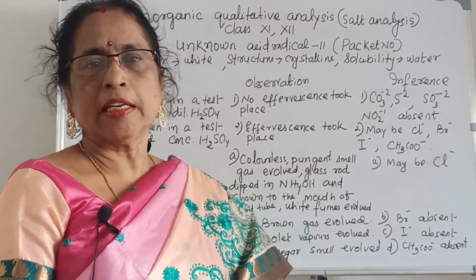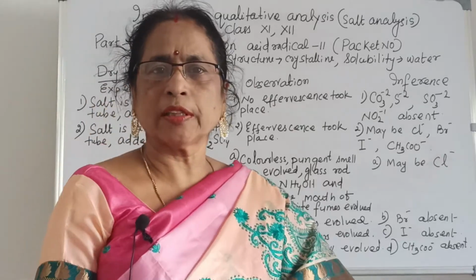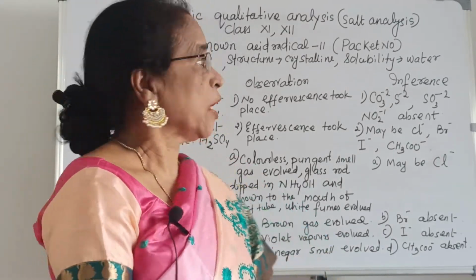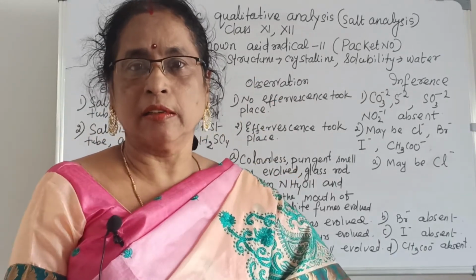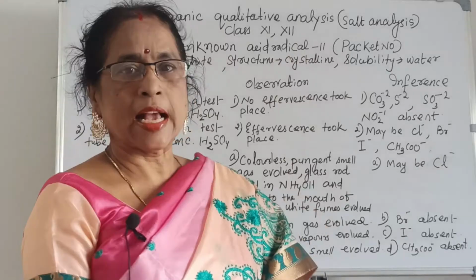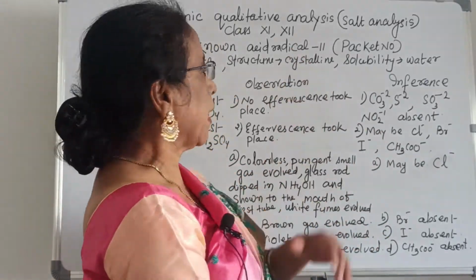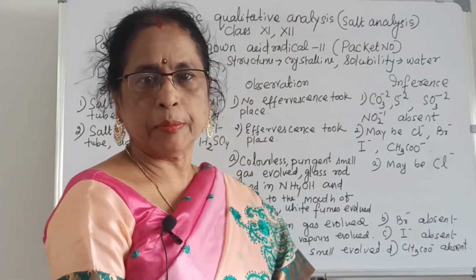In qualitative analysis, this is part 13, and it is very helpful for class 11th and 12th in practical chemistry. Here, packet number 11, an unknown acid radical, is given to me.